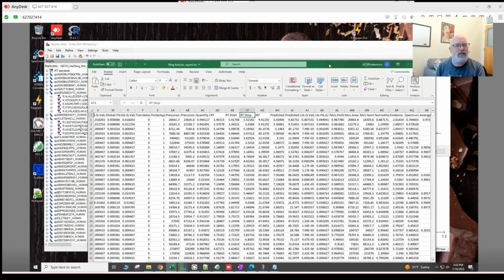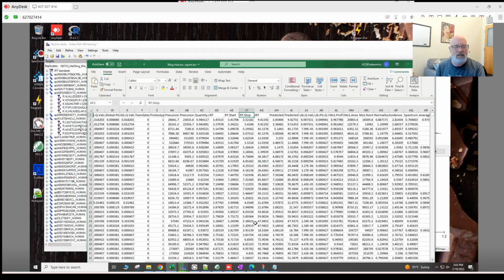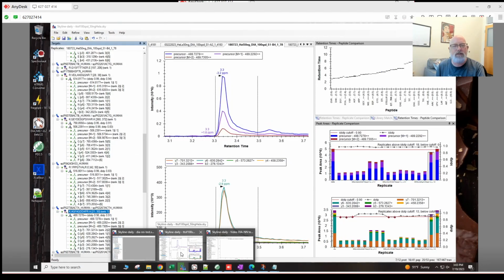All right, so what else can we do while we're waiting? I think that's about it. And do I have any other ones open?